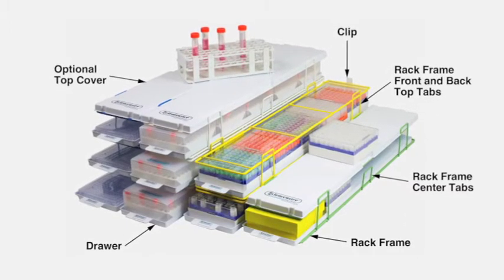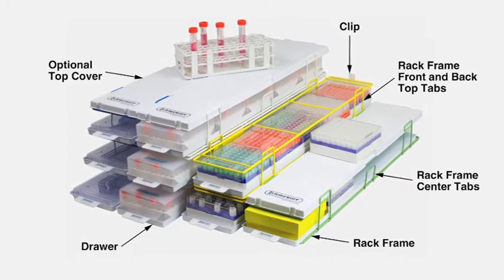Make sure your rack frames are facing the right way, and attach the clip to the back of each frame.